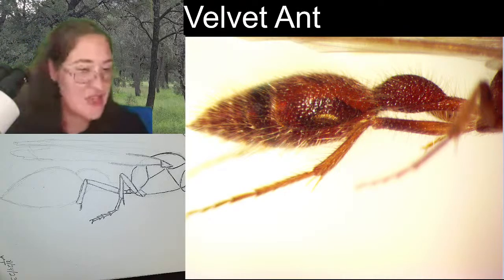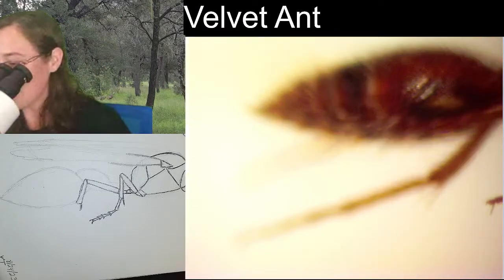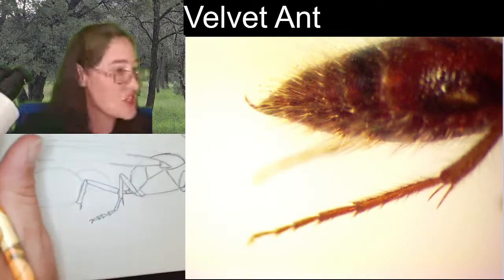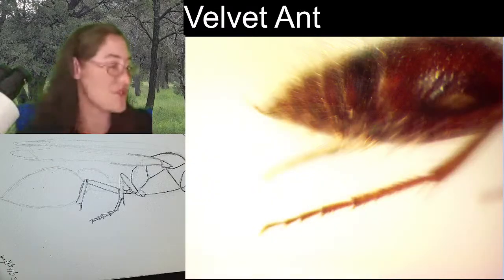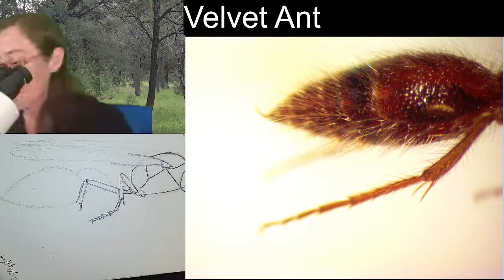At this focus, we can see this guy really is fluffy. It's just thinner. Yeah! It's still fluffy. It's still a velvet ant. It's trying really hard. And you can see that there are two tibial spurs from this point of view, too. So you can add that if you would like. And I do believe the middle leg has two also. It's just that we couldn't see it from the angle we were looking at it.